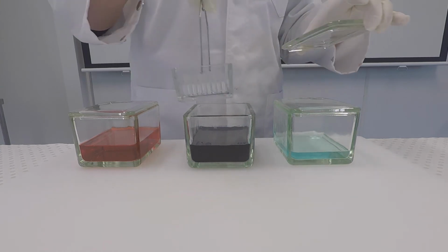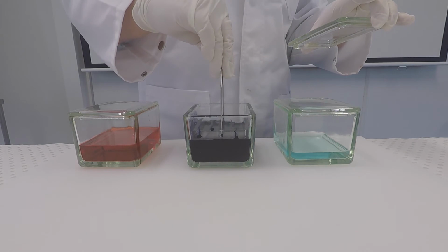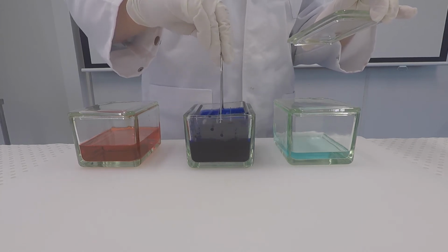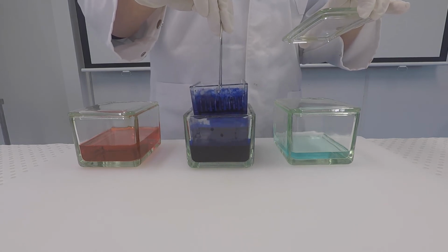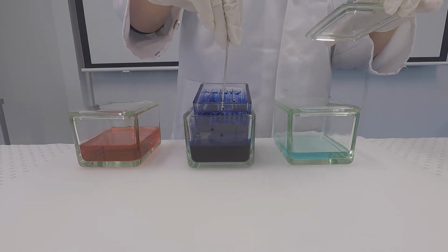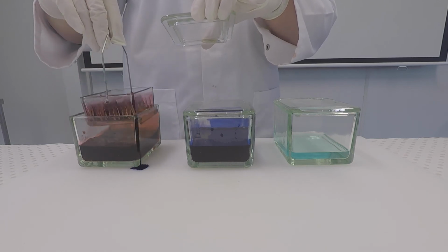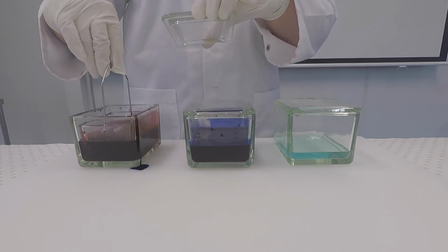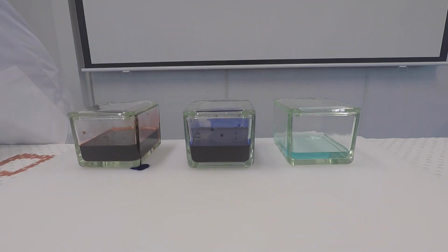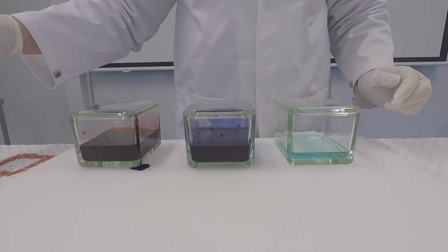The second staining jar contains a dark purple stain or blue stain that stains the nucleus of the cells. We'll dip it in that a few times. In the third staining chamber, there is an orange solution. That's designed to stain the cytoplasm of the cells. We'll again dip it in several times, after which we'll rinse under the tap. Again, we'll allow to air dry, and then we can look at this blood smear under the microscope.